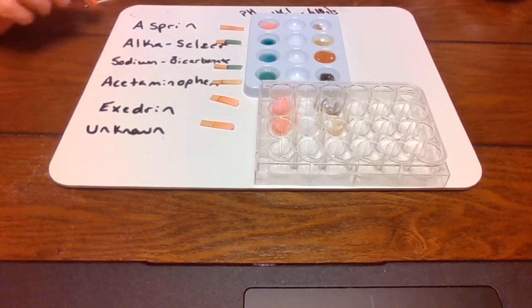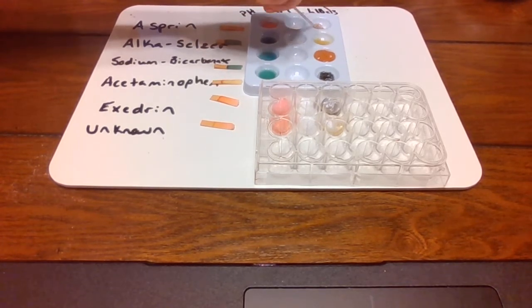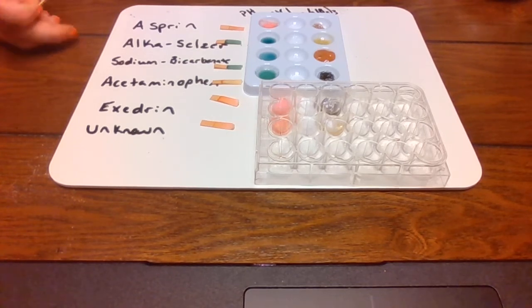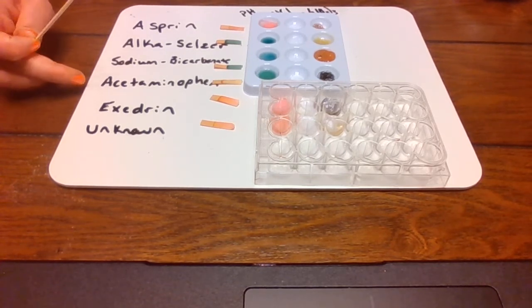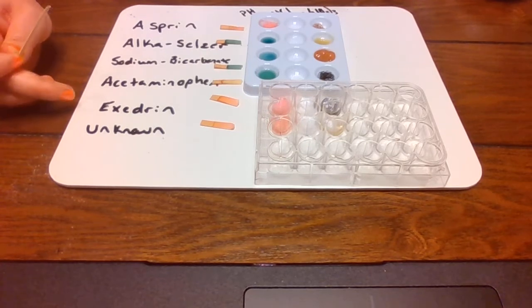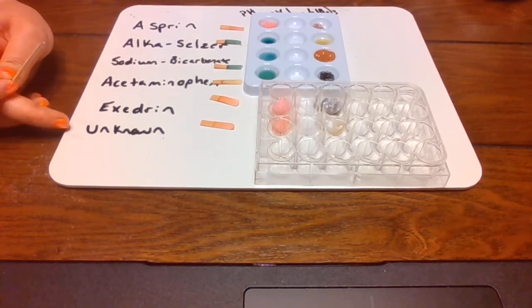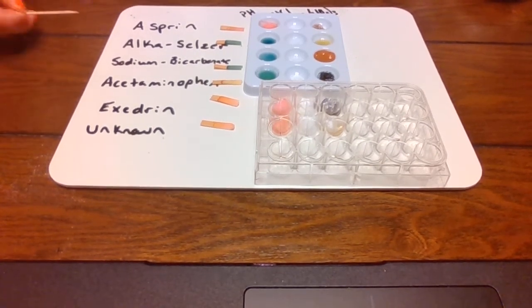Okay. So what we're looking at is for aspirin, it's kind of looking like it didn't fully dissolve, and it's kind of like a muddy, orangey, yellowy color. For Alka-Seltzer, it's more of like a neon green, yellow color. For the sodium bicarbonate, it's like a gross looking thick putty that's orange. And then acetaminophen is black. And then for Excedrin, it's also looking kind of blackish. And then for the unknown, it's looking more of that yellowy, orangey kind of color.